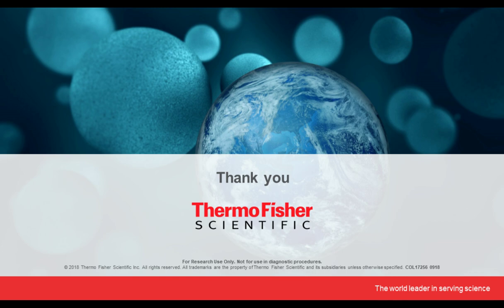There is another continuation from there: we have also developed a new method where we not only look at the enrichment of the target, but can also map the epitope binding site for each one of these antibodies that we have validated. So we can confirm that this antibody is indeed binding to the epitope that it is designed for, and it's very valuable for the phospho-specific antibody.